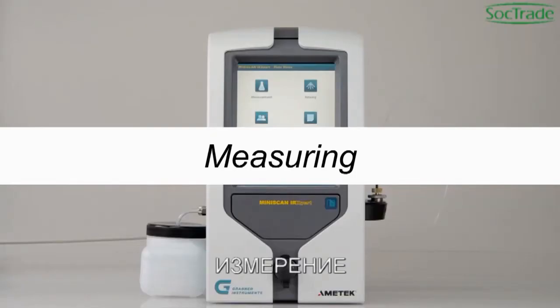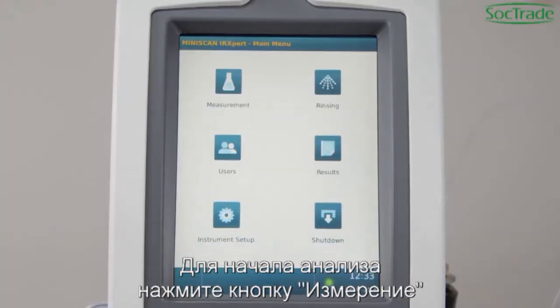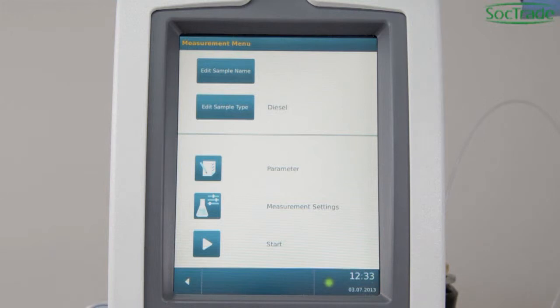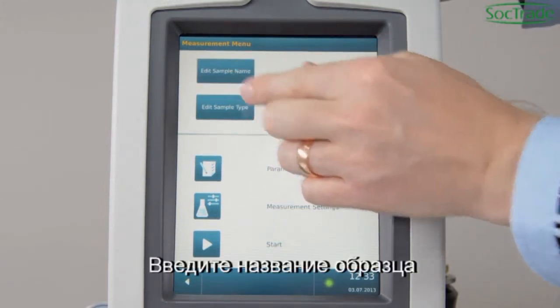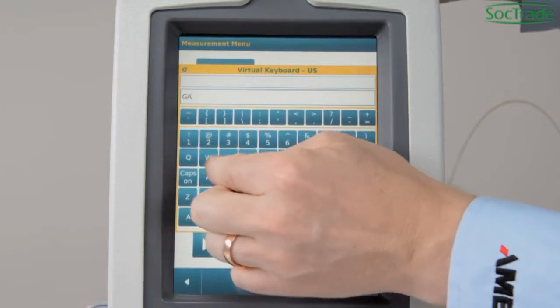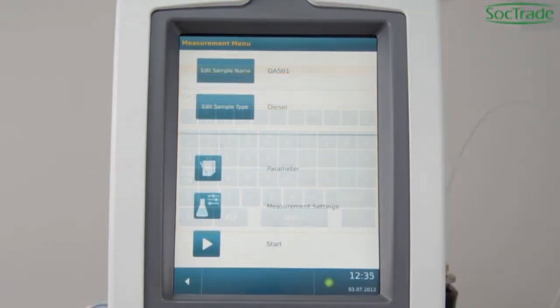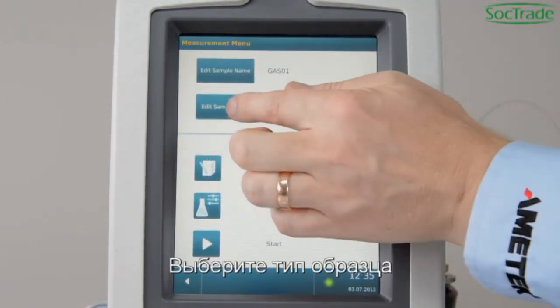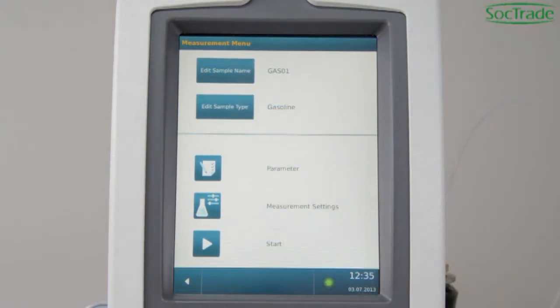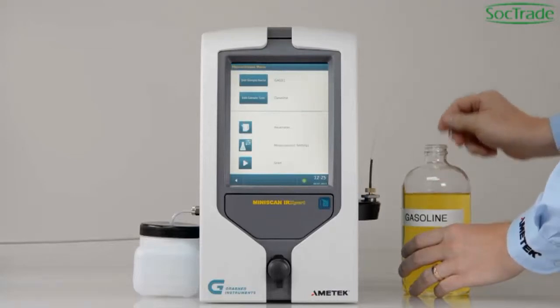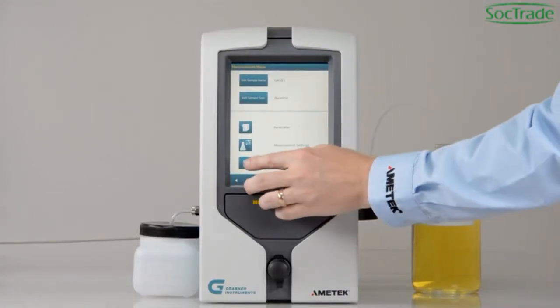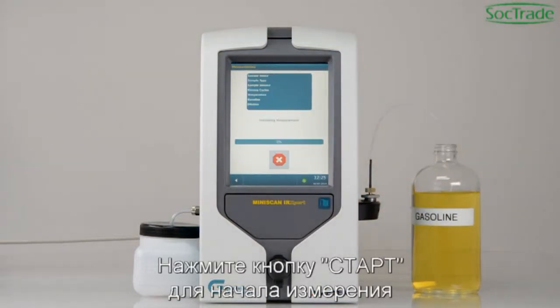Measuring. To start a measurement, go to Measurement. Insert the sample name. Select the fuel type. Put the tube into the sample. Press Start to start a measurement.